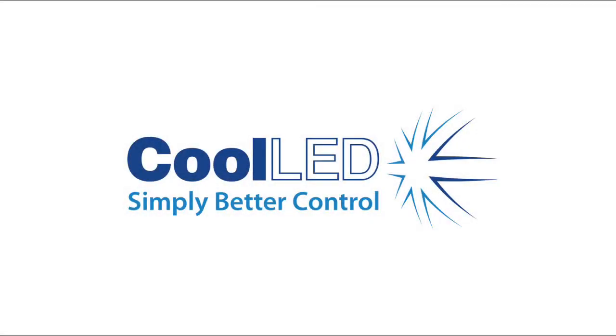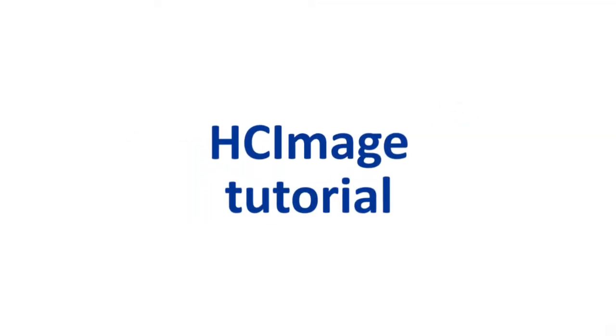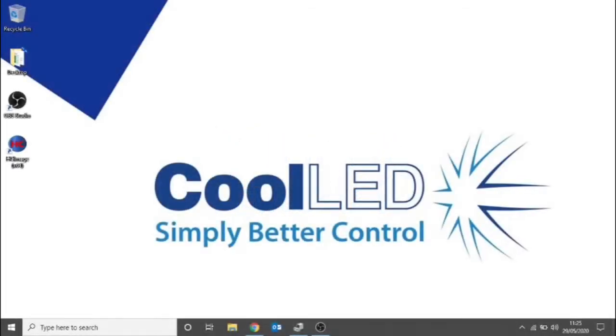Hello, and welcome to this CoolLED tutorial video for HCImage from Hamamatsu. In this video we will show you how to set up and integrate a pE-4000 into HCImage.